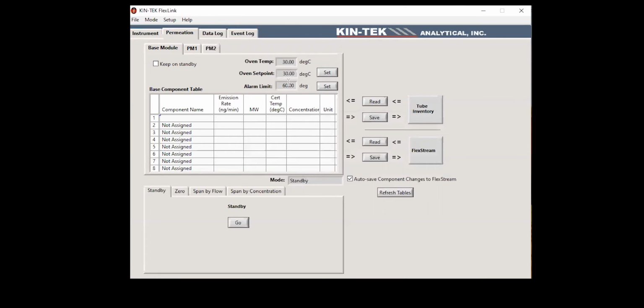So if I wasn't thinking and a couple of days later I come through and I changed the temperature set point to 60 degrees C and I didn't realize that I had my alarm limit, I would hear an alarm. In the alarm state, the oven actually cools down to a certain level, but then it'll start heating again and it'll hit that alarm again. So until the alarm's changed, it will not go above the alarm set point.